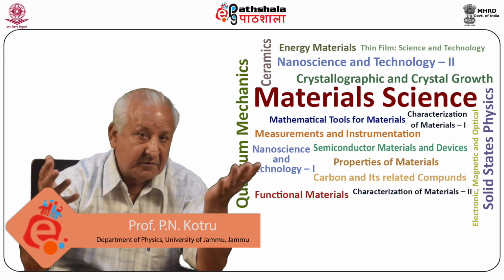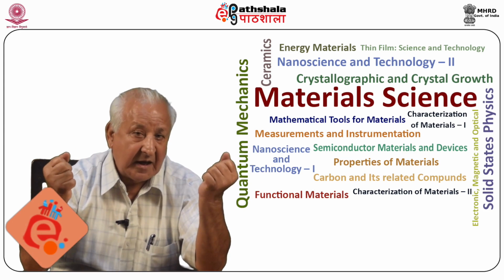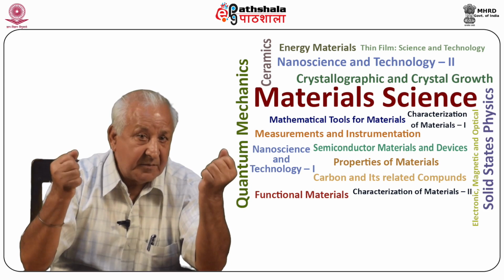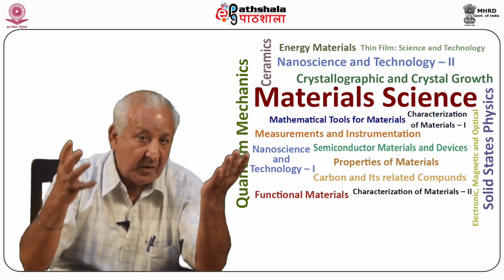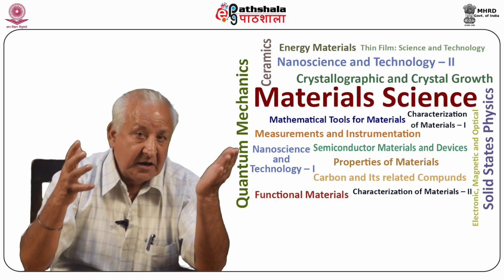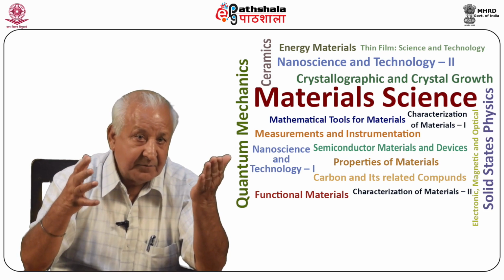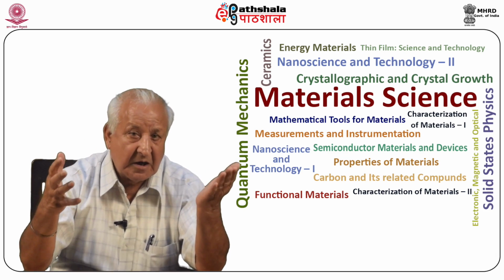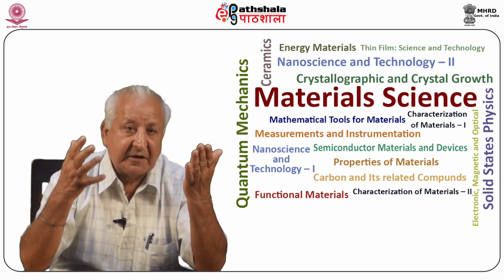Growth mechanism in gel and nucleation control in gel methods have been explained. Various methods used for growing crystals using gel as medium of growth are described. Advantages and limitations in using gel as medium of growth have been explained. Some examples of crystals grown by gel method have also been given with details.